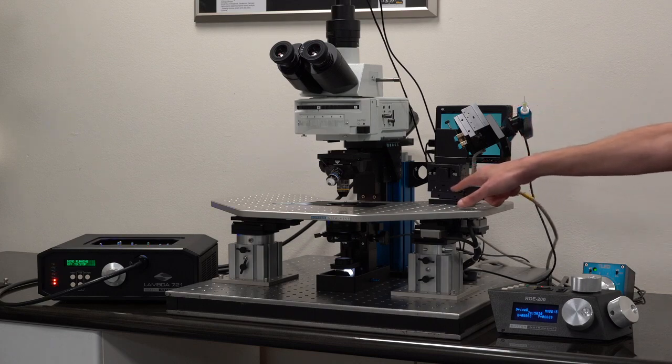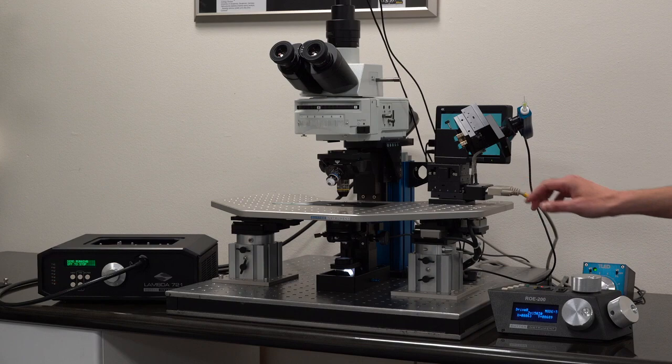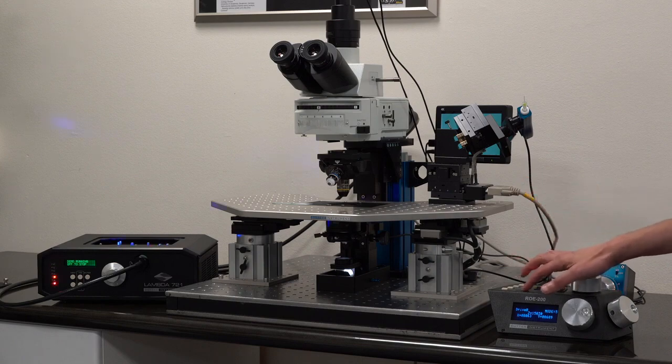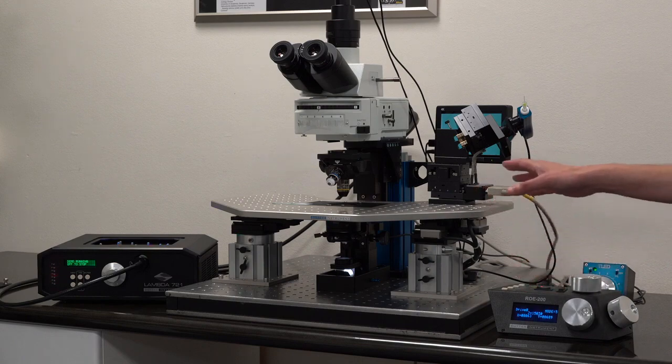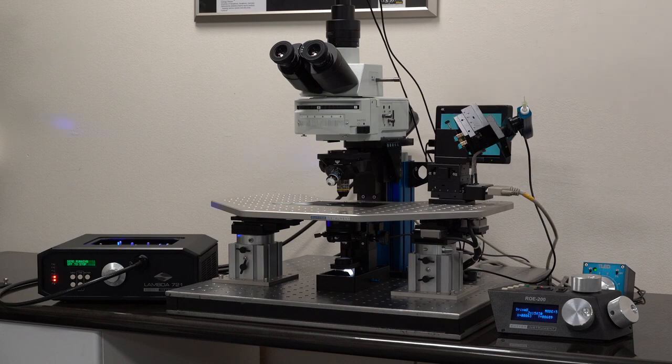So my new 845 manipulator connected to an MPC-200. Later on, I will show you different controllers for the same manipulator on another stage similar to this one.